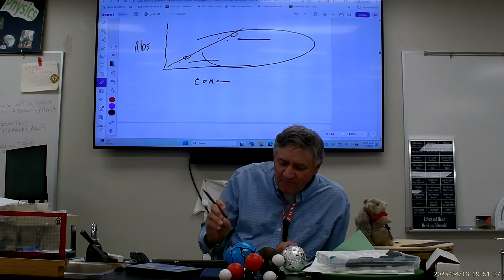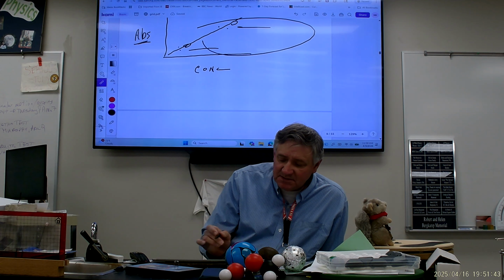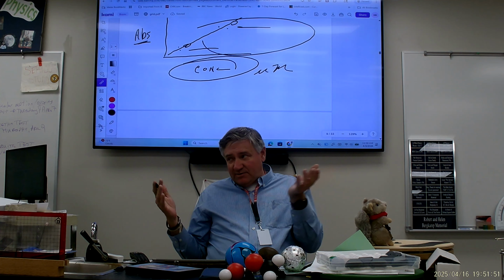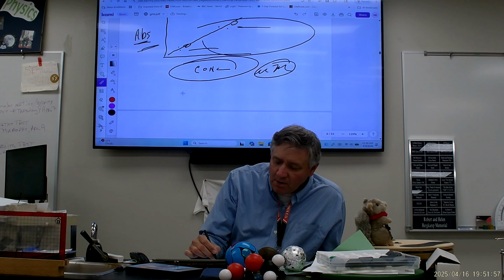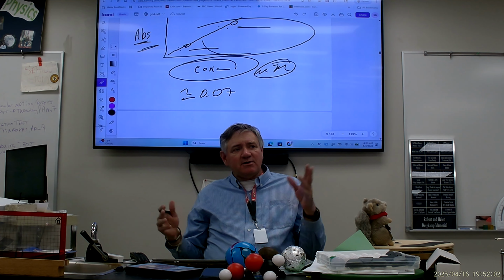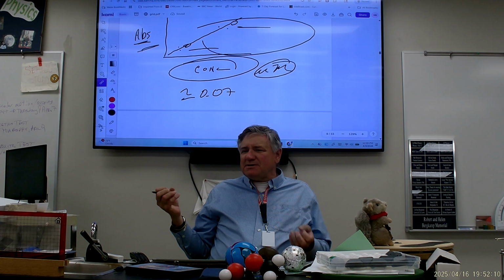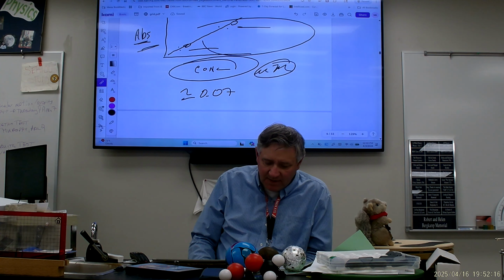If you look at the units, the absorbance doesn't have any units. Then you have your concentration, which is in micromolarity. So your slope doesn't have any units in terms of your y value, but it does in terms of your x. Hopefully your slope is something around 0.07, with some variation on that. If you have a slope of 15, that's bad. But it should be somewhere in that neighborhood, with some variations based upon that.